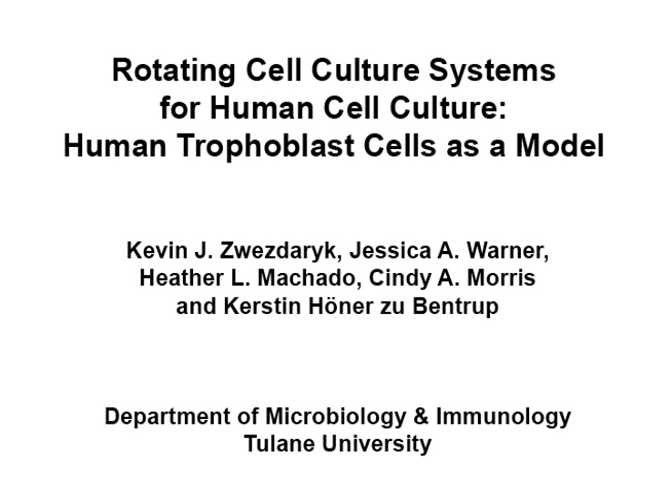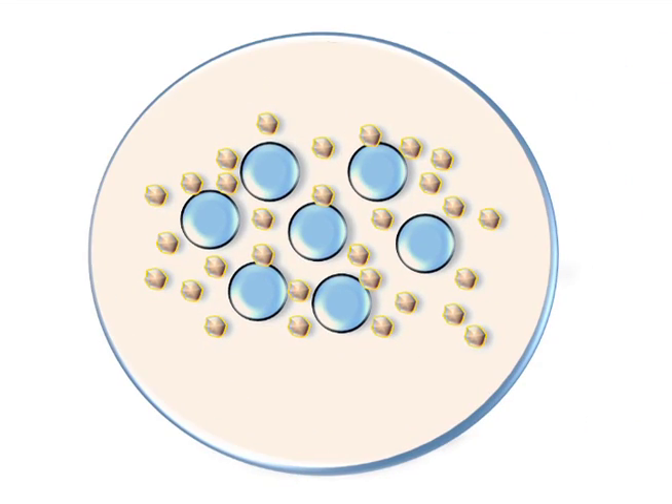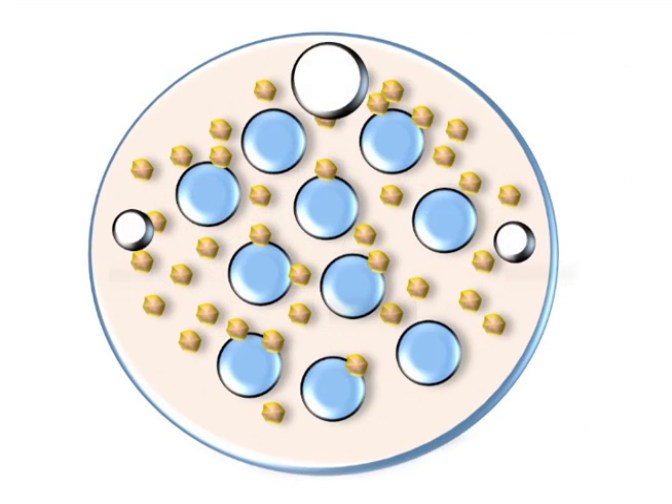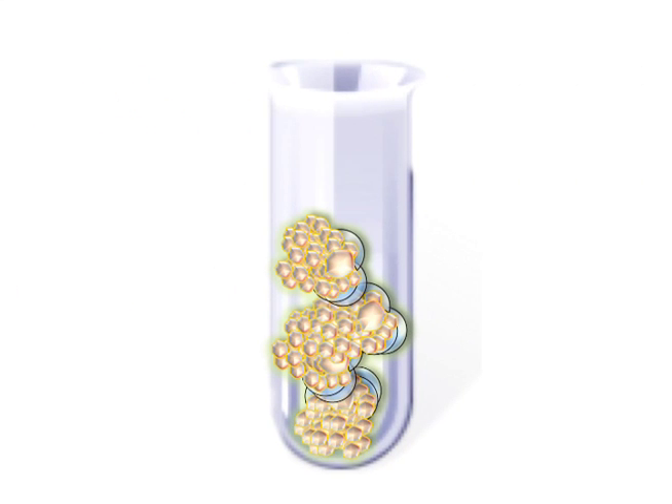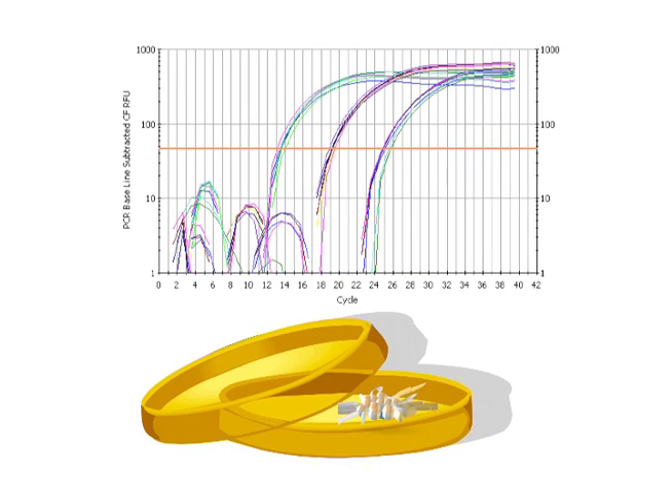This procedure uses a three-dimensional cell culture system to mimic in vivo cell kinetics. Begin by incubating cells with collagen-coated beads, then load the cells and beads into a rotating cell culture system and propagate 3D cell aggregates in a low-shear, low-turbulence environment. Finally, harvest the cells for use in downstream applications. Compared to gene expression and cellular differentiation of cells grown in a typical monolayer, the resulting 3D cultures demonstrate cell kinetics and behavior that closely resemble that seen in vivo.